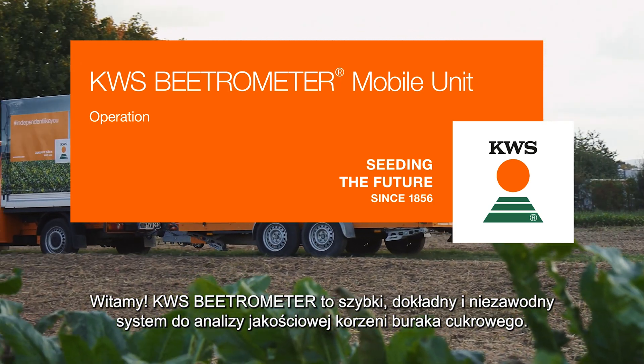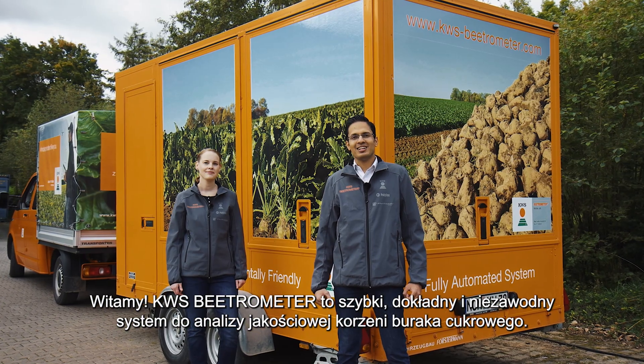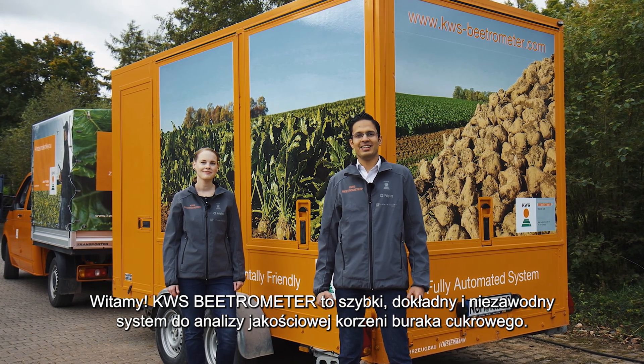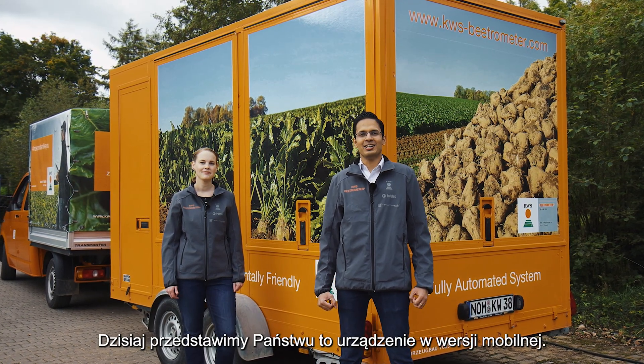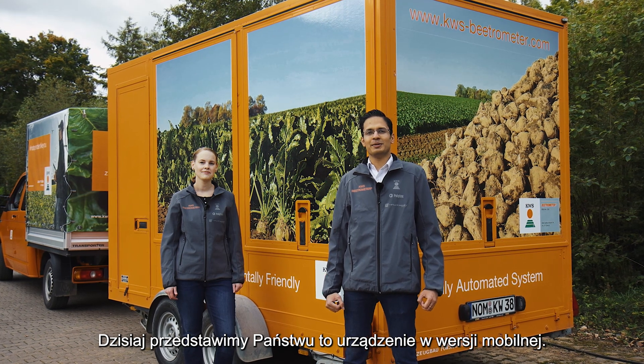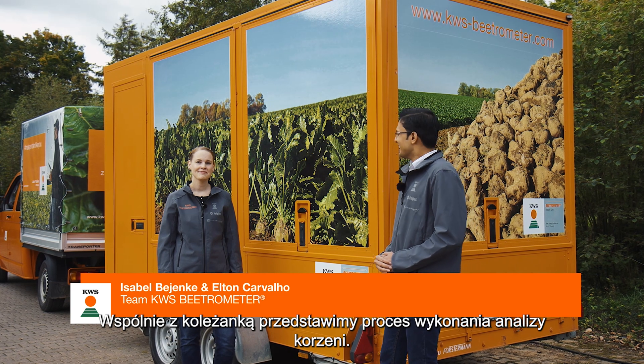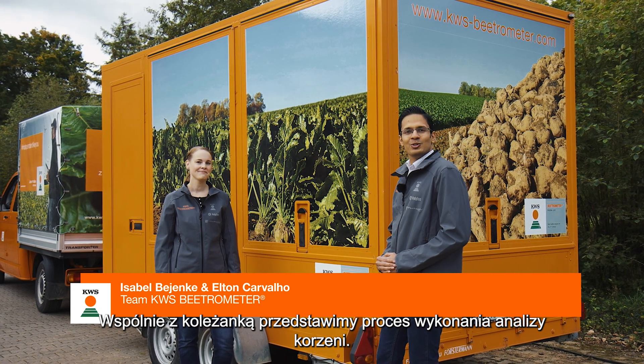Hello. The KWS Beetrometer is a fast, accurate and reliable system for beet quality analysis. Today we are here to show you the KWS Beetrometer mobile unit. Together with my colleague Isabel, we are here to run you through this process.